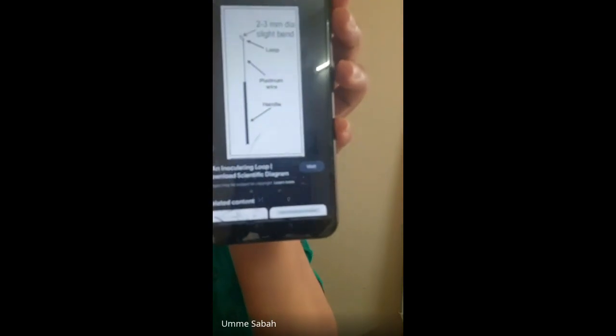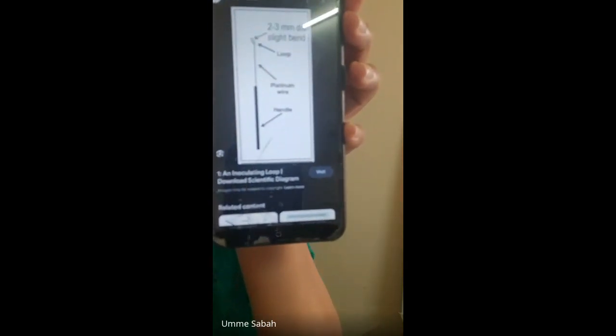All right. And then after these apparatus, your glassware are a must. So every micro student will be holding, everyone wants Petri plates with them, okay? So if you can see, this will be the structure of the loop. This is how the loop is.